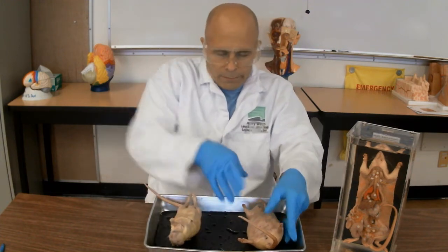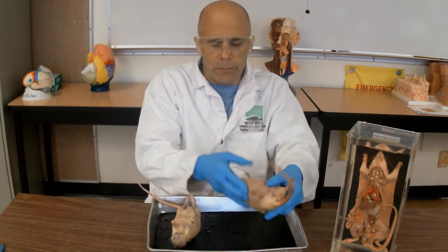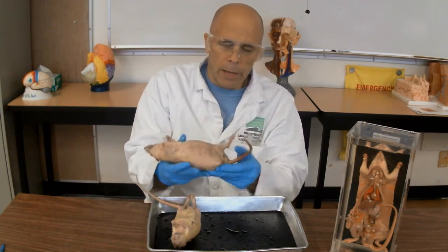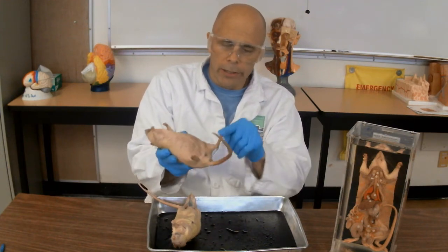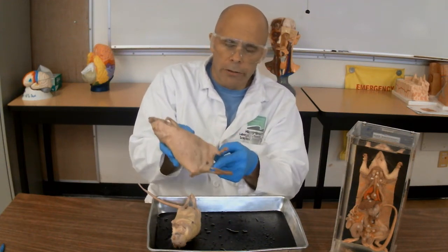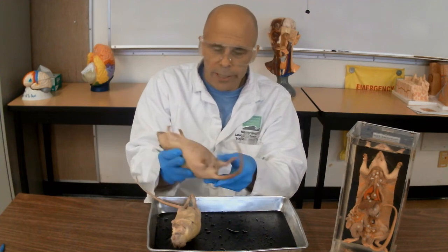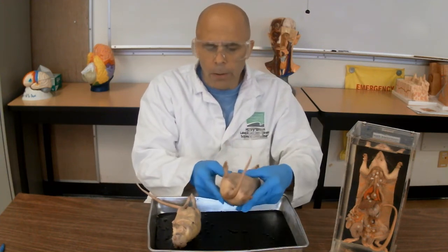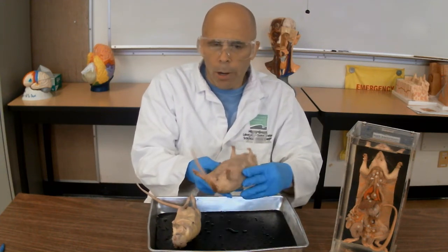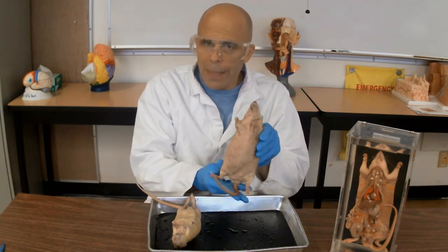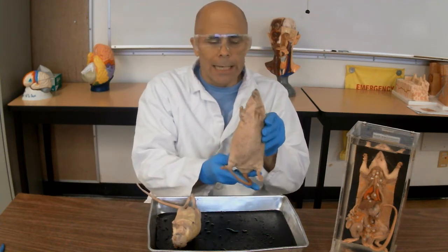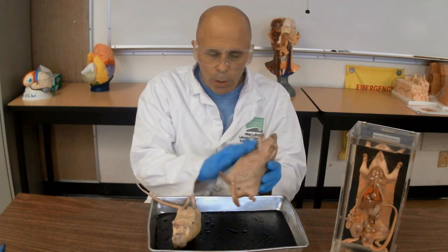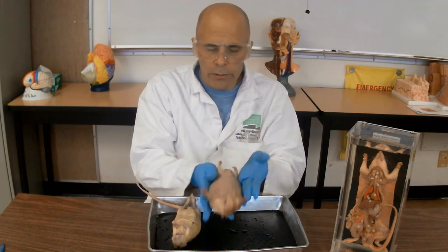Now look at this other, larger one — this is a female. I know that because I can look in the same region and there is no scrotum or testes, which makes this one a female. What's unique about this specimen is that it's a pregnant female, and that's why it's so large.